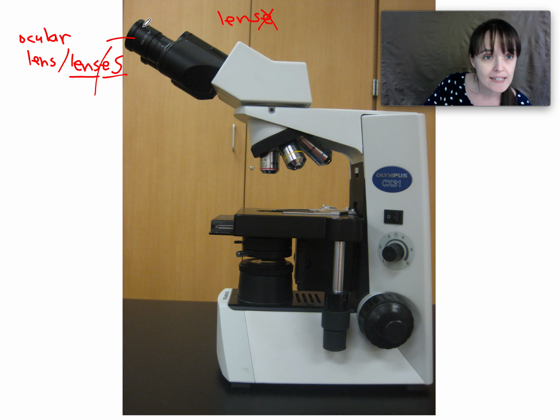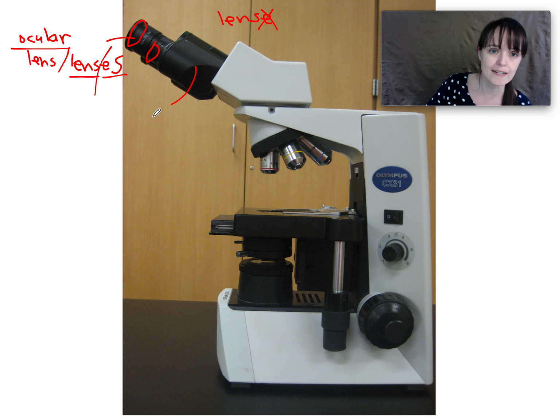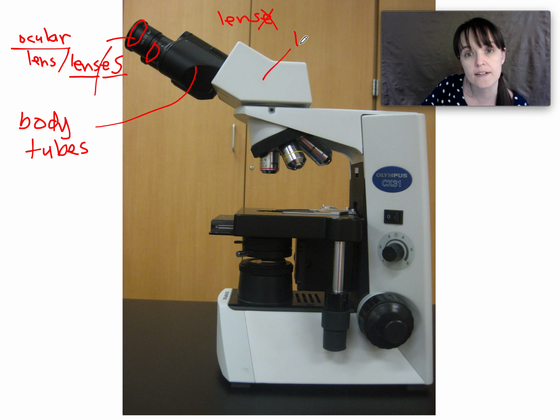So these round bits here where you put your eyes are the ocular lenses. Ocular means eyeball. And then these behind them are the body tubes. And this giant chunk here is the head.